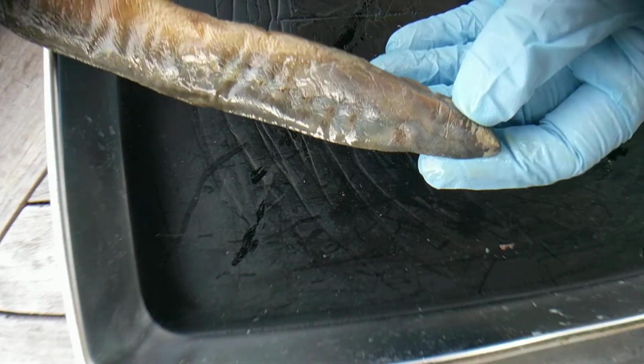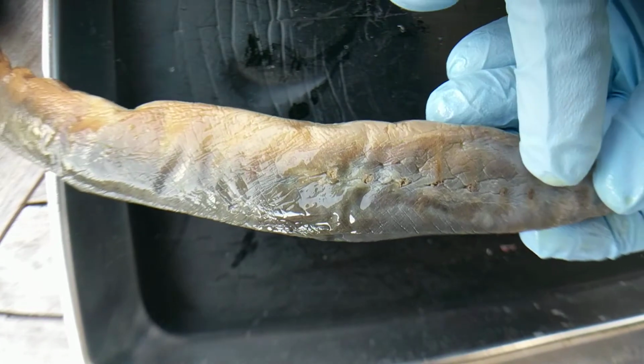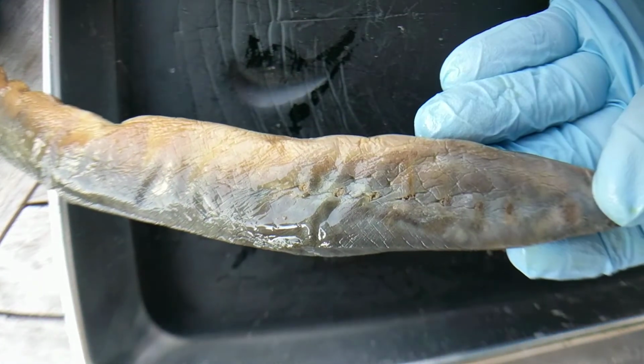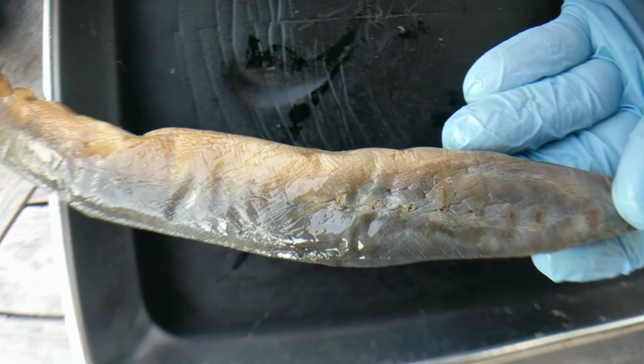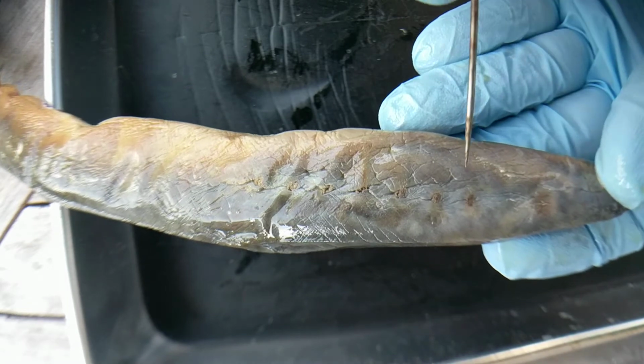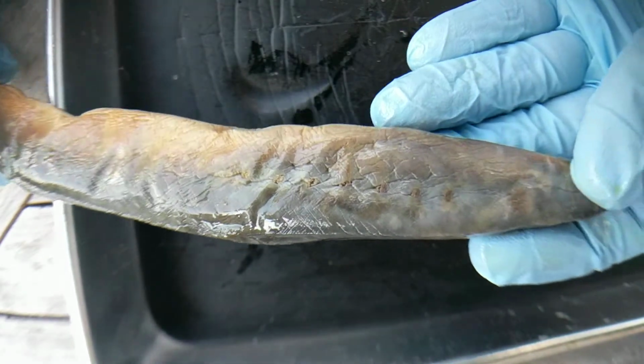So this is the head, right? And if we look very close, do you see these little dots here? Those are the gill slits. Let me get a probe, I can show you. They're not full, they're like little openings here. This one, this one, this one, right? Those are the gill slits.